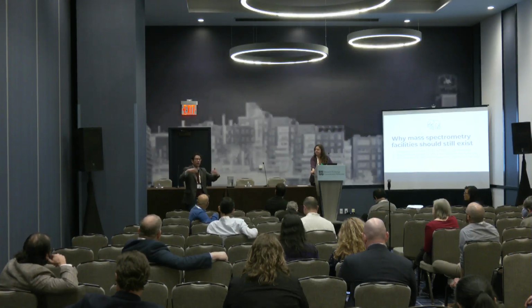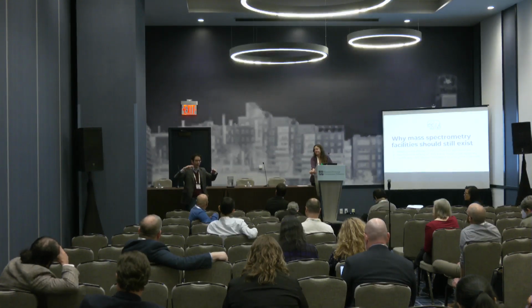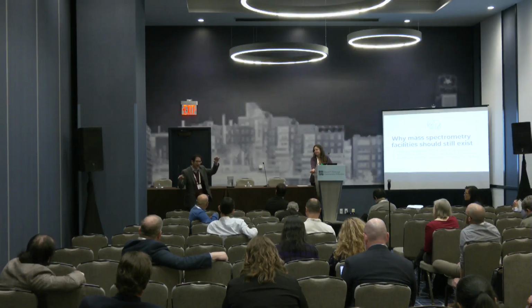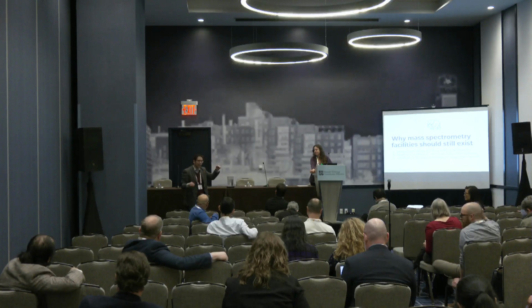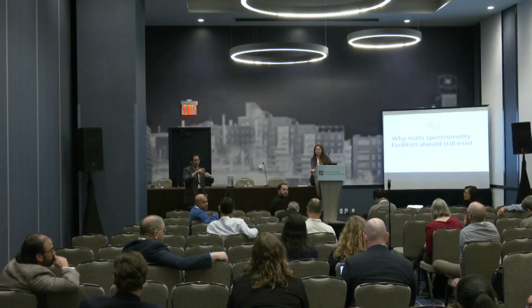Again, it depends on sort of the situation in your facility. If you feel like you can put them on equal grounds and not make it a mass spec core that does Olink on the side or Soma on the side, I think that's the important thing, right? These are equal partners that can work equally well together to tackle different aspects of the problem.